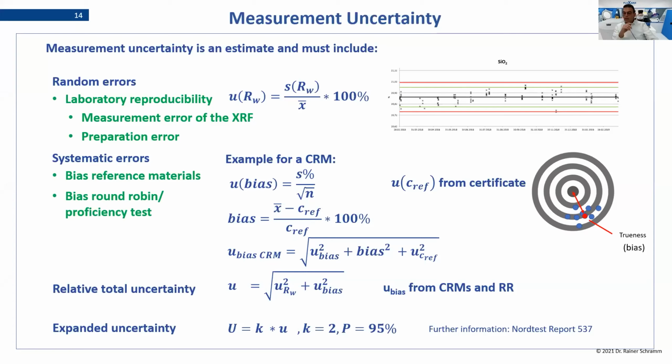So then there is another question. Our XRF instrument does not report negative values. Should we then, instead of a blank sample, use a low concentration sample for determining the LOD? Perfect question, and you're right, I would do it. Because when you can't see the negative part, it is useless. You can't really use it.